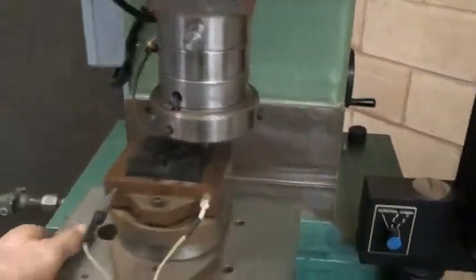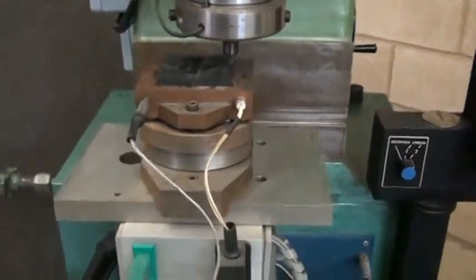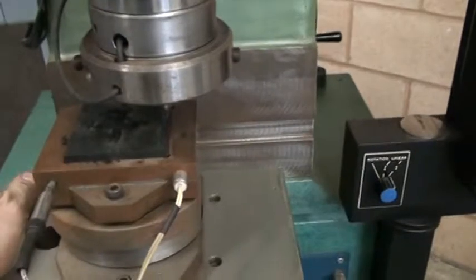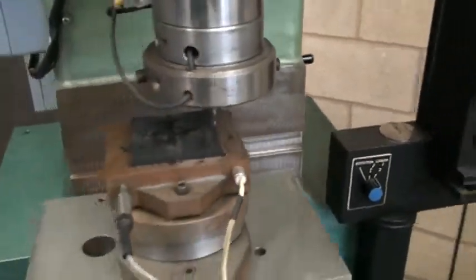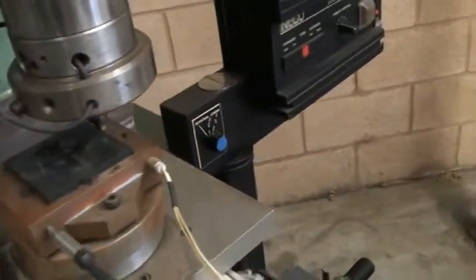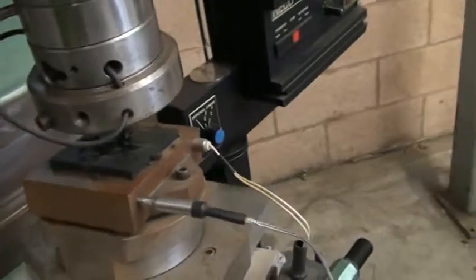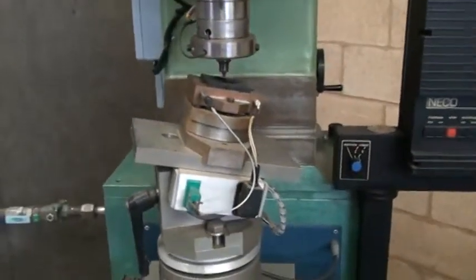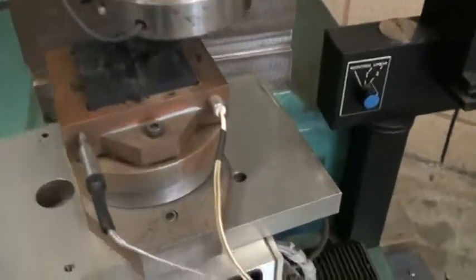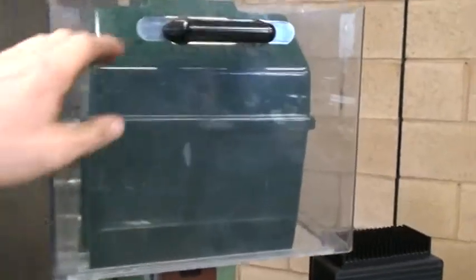We'll go ahead and try a couple of modes out. The table tilts as well for changing the plane of the rubber surface, as you push down over here. Go ahead and shut the guard.